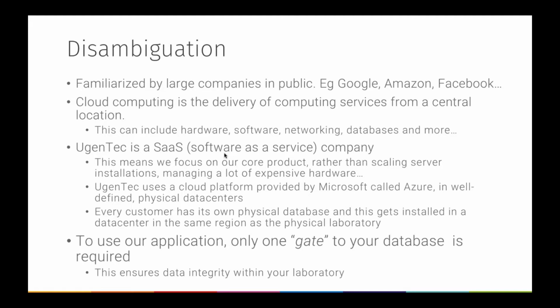And this is actually hosted in well-defined physical data centers, which have very state-of-the-art security measures. And what's important to note is that every customer has its own physical database, and gets installed in a data center in the same region as the physical laboratory. We know, for instance, in German and UK settings, there are often local regulations to comply to, and Microsoft actually has put a lot of work into complying with these regulations and setting up local data centers where the data can be put.